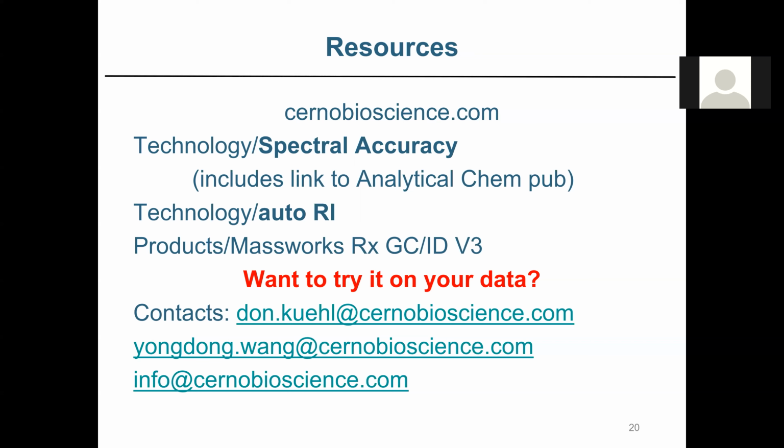I didn't really delve into that. I didn't have time. Unfortunately, I went a little over, but you can make PDF reports, and those columns that you see are fully customizable. You might have seen the dialogue where it has a bunch of check boxes. You just go in and say, I want to see the CAS number. I want to see the NIST accession number. I want to see the molecular weight, the formula. I want to see the quantity. I want to see the area. I want to see the height. You can customize it for all those kinds of values to your heart's content.